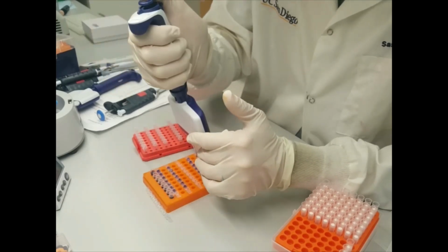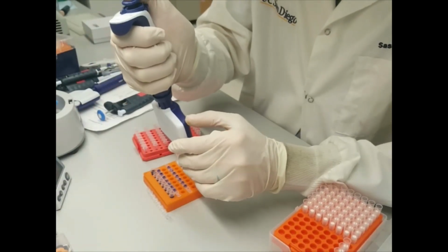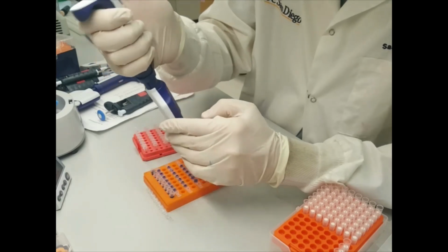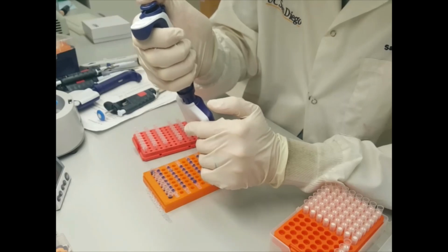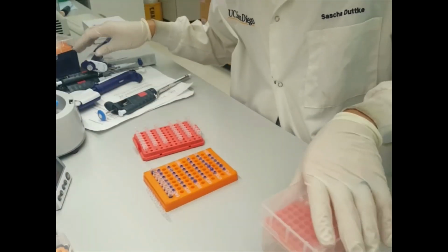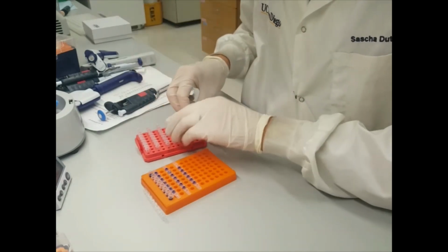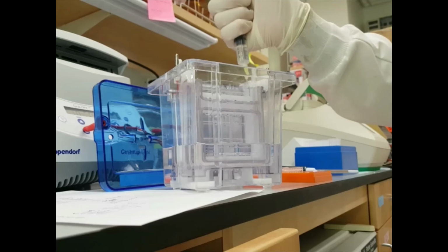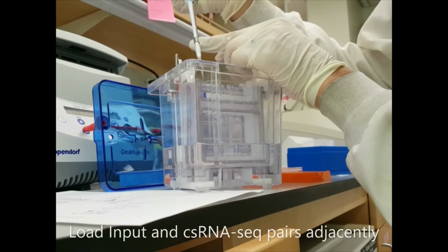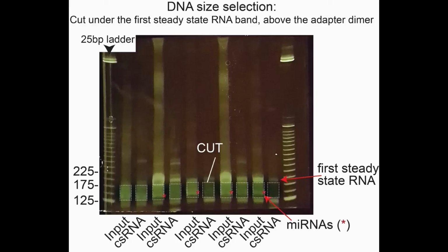While the beads are drying, you can already add about 25 microliters or even more of 1x DNA loading buffer to the lid. As a rule of thumb, I only load 50% of my PCR reaction on a gel. This is that on occasions the 10% TBE gels that we purchase are faulty, or God knows what can happen. However, in short, just adding 50% of the PCR reaction should not really make a difference for the final sequencing run. Next, when loading your DNA gel, remember it is important to load input next to the csRNA-seq sample to ensure that when you cut, the size selection is identical for both.